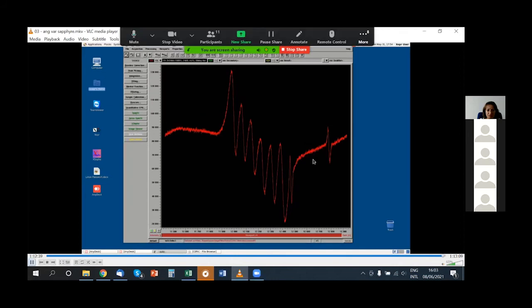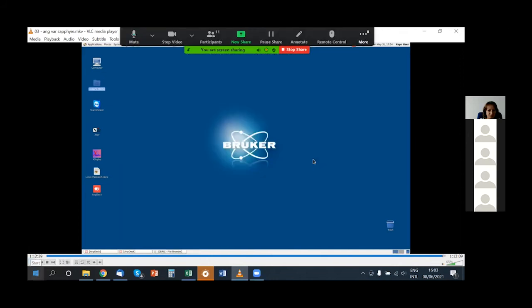One moment. Okay. So this was, I would like to see again something.